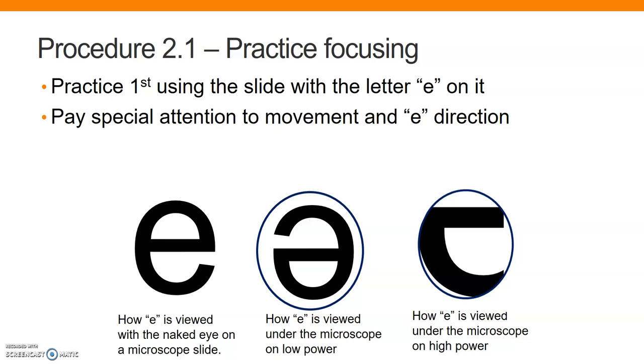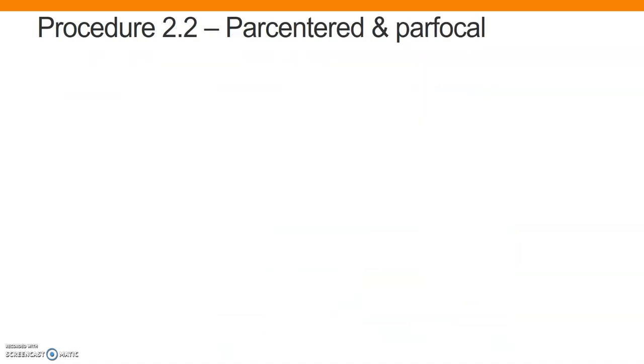You'll see what kind of looks like part of the E, but not really the E. We lose the whole image. So as you zoom in, again, resolution will get better. You will see a lot more detail of the typewritten E, but you will not see the whole image. And that's part of what happens as you are practicing learning how to use the scopes.